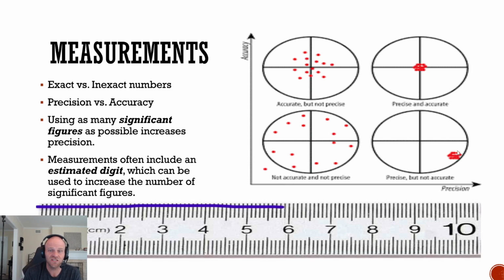That is precision. Accuracy is how close it is to the actual value. Okay, so that's whether or not you're right or wrong, how accurate you are. The goal of science is to be as accurate and as precise as possible. When you do measurements, you want them to be repeatable, right? That's why we say we like precision.